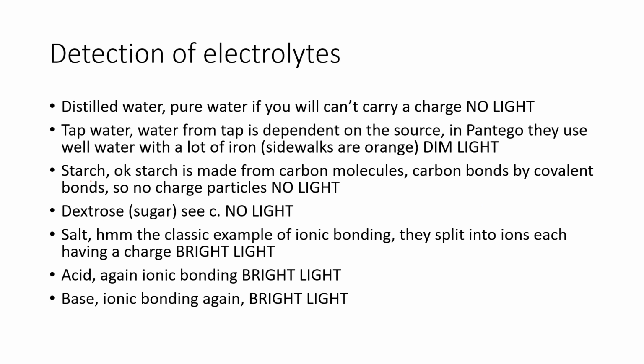Okay, from there, we take some of that starch suspension that we had put into a beaker earlier, and then we put it up to the lights. Since starch and the next one we're going to talk about, sugar, are both made out of covalent bonds, those bonds are very strong and tightly held together, so they don't conduct electricity. So neither starch nor glucose or dextrose can actually conduct a current, so none of the light bulbs light up for that. Then we get three things that are all ionic.